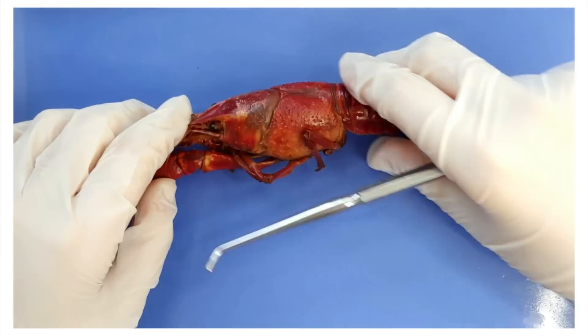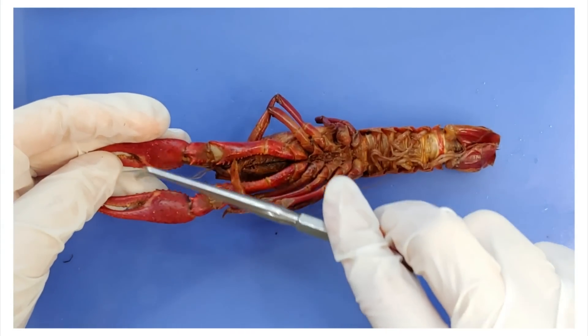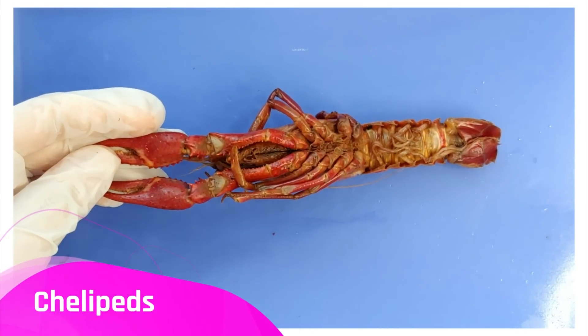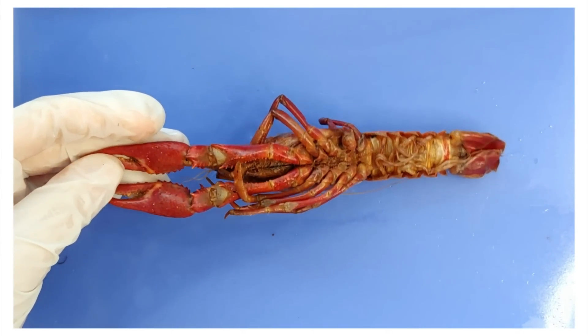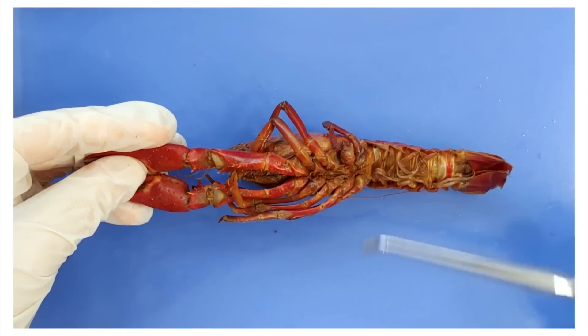Crayfish have five pairs of legs, meaning ten total. The first two here are highly modified. They're called chelipeds, and they're used for cutting up food, capturing prey, attacking one another, and as a defense against predators.